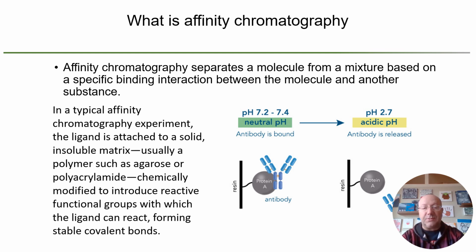Usually, the beads that we use in this are either agarose or polyacrylamide. They've been chemically modified to introduce reactive groups, and that's how the ligand is put on the resin.